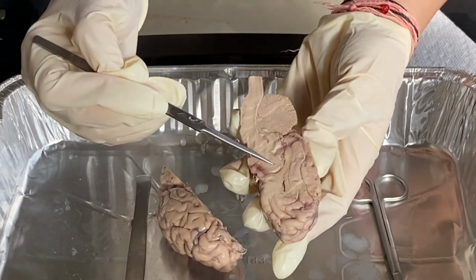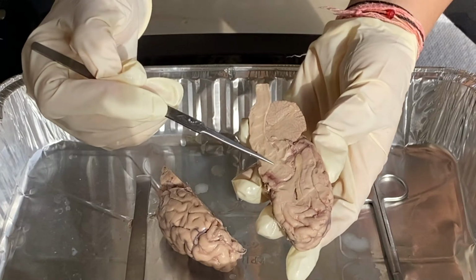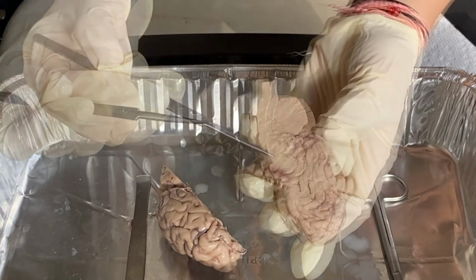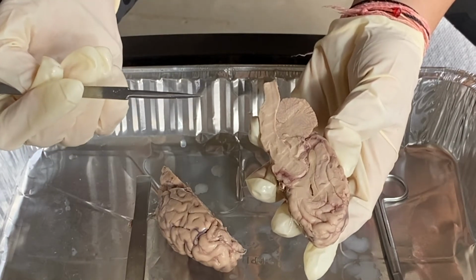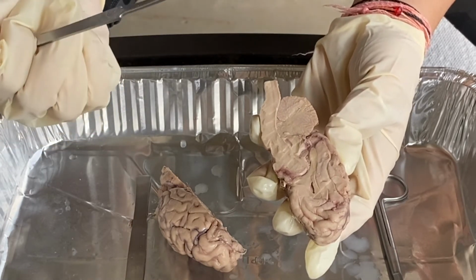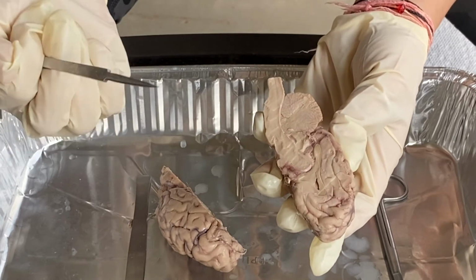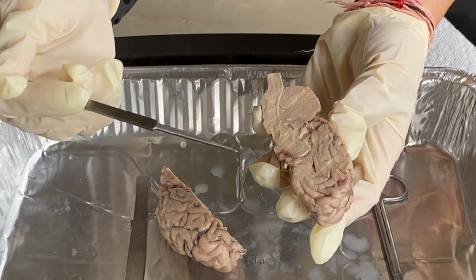So this is the thalamus, and the thalamus basically relays sensory impulses from all the sensory receptors except for olfaction. A sensory impulse basically travels down from the body surface toward the thalamus, which then receives a sensation and relays this to the particular part of the cerebral cortex for interpretation of, for example, touch, pain, or temperature, or one of the other sensations.